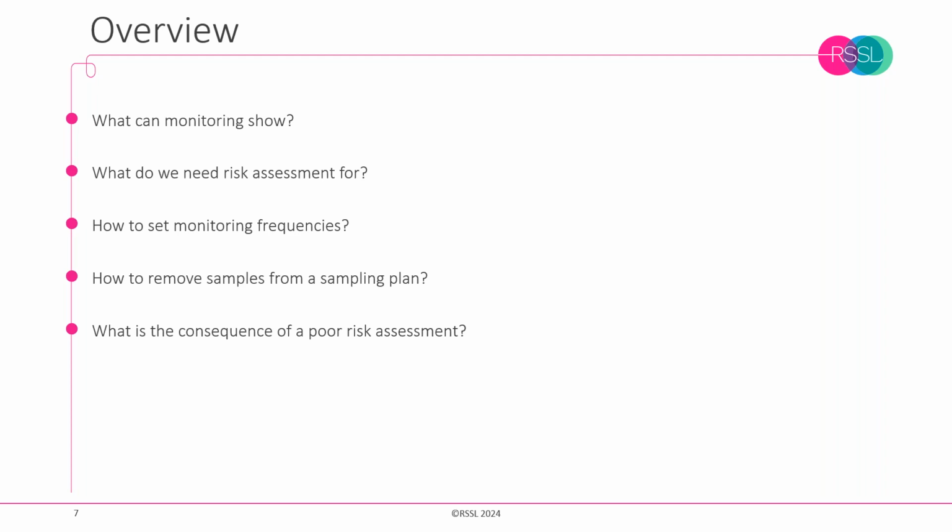We're going to be looking at how we can determine how often to monitor. So we know that for aseptic processing, it's fairly clear cut. It's asking for continuous monitoring. But what about the support rooms? What about, even if we're sterile manufacturing in grade C or D areas, or if running a non-sterile facility? How do we come up with frequencies of monitoring that make sense?